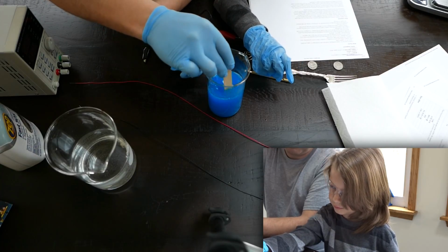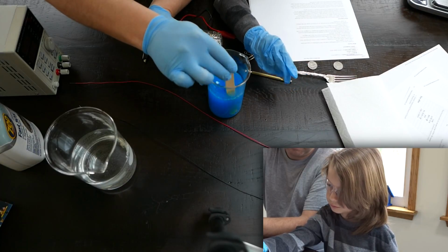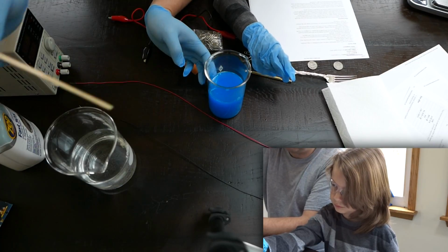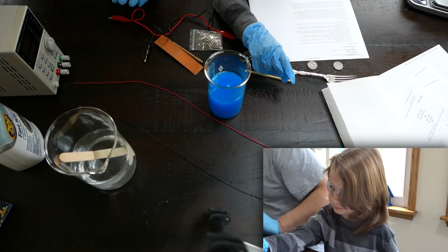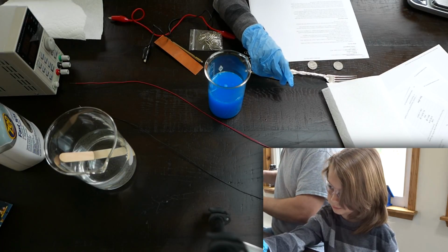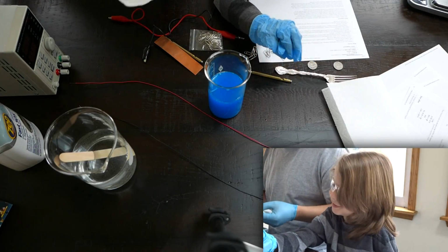Alright, so I'm going to. That looks pretty good, right? Mm-hmm. Put this on you there. Alright, so next I'm going to clean while you're sitting there. I'm going to clean the 2 quarters and the fork with the degreaser, okay? Okay. Unless you want to do it. You want to do it? No, thank you. You sure?